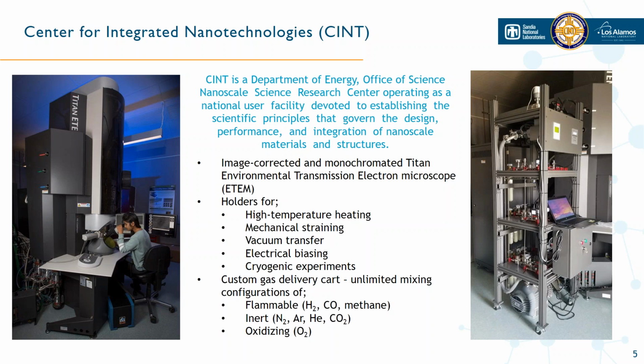Great, thank you, Ben. So as you said, we are at CINT, and this is showing the microscope that we were using for these experiments. It is a Titan environmental TEM. It's image corrected, monochromated, and we had the K2IS camera on there, and then we swapped it to beta test this K3IS camera.